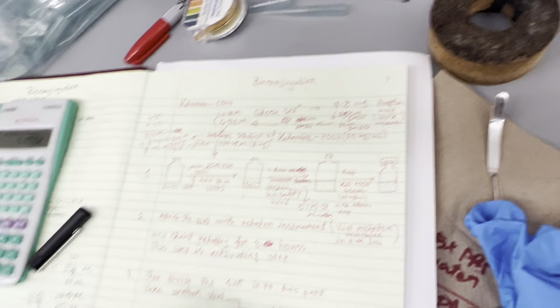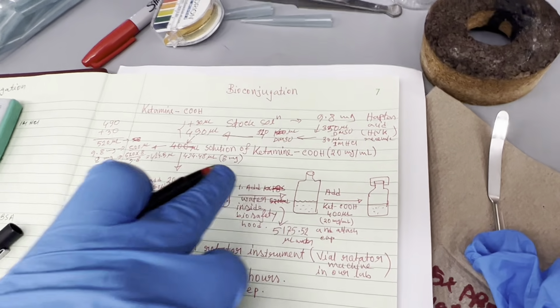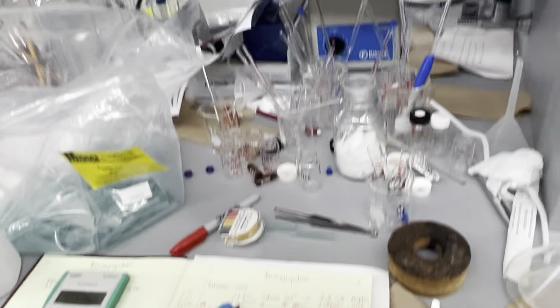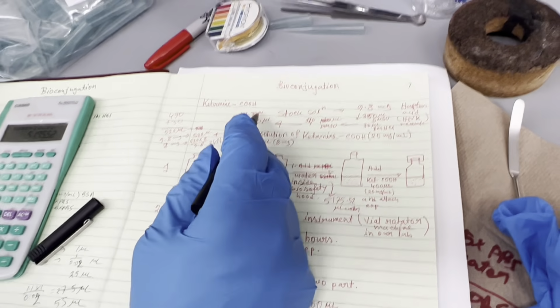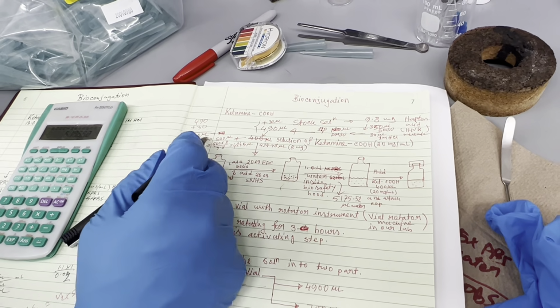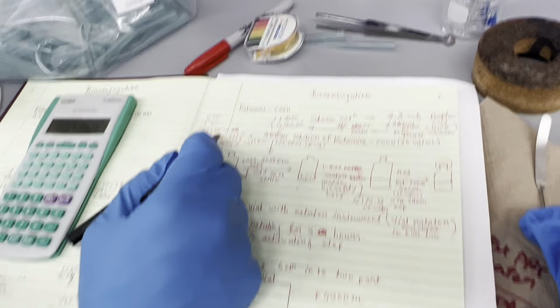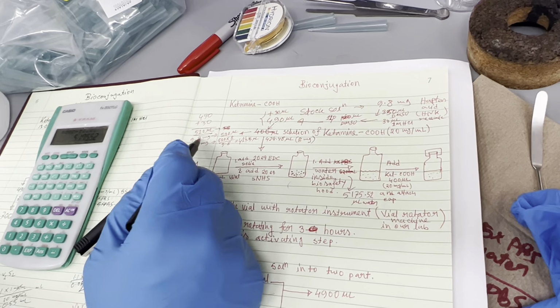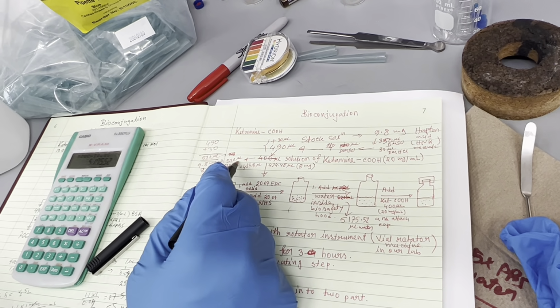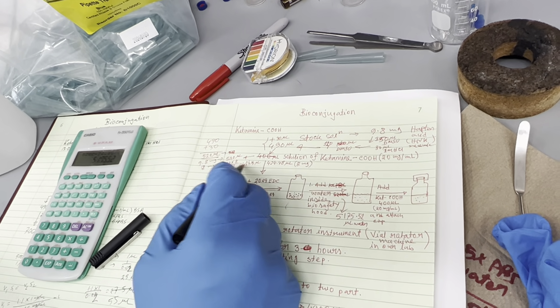So I adjusted. Okay. So our total volume, we are using 490 microliter DMSO and 30 microliter HCl solution. Total volume will be 520 microliter, right? And that original amount is 9.8 milligrams. So 9.8 milligram contains 520 microliter. So 8 milligram will contain how much? 424.5 microliter.